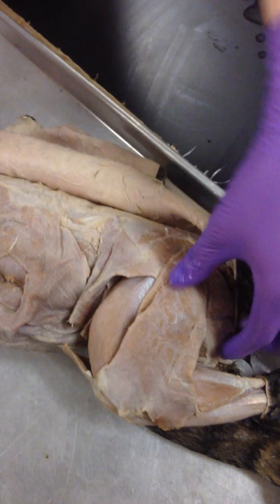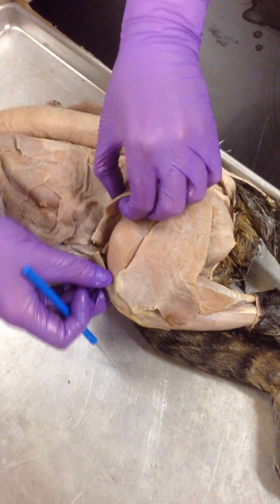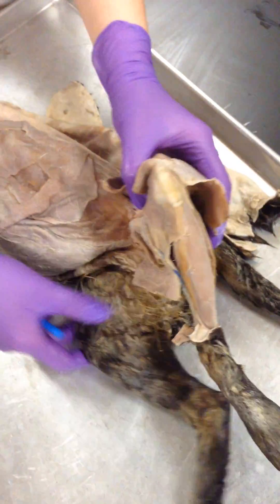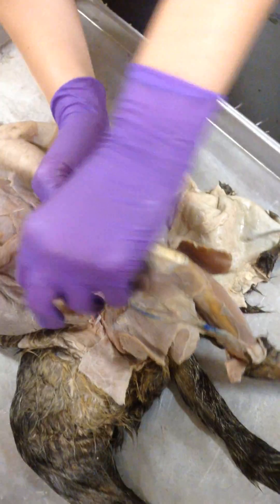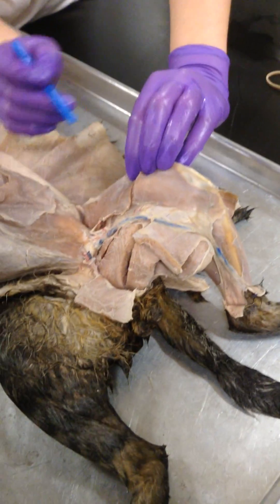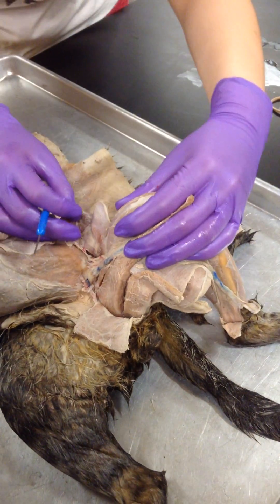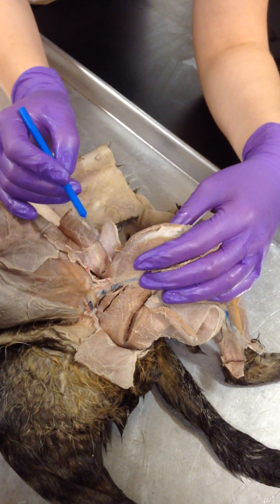This is the triceps. So we have our biceps femoris and our sartorius. And then we go on the inside of the leg. All right, you see the sartorius again. And the triceps are here. It's a big flap on this side — it's small on the other side, but on this side it's this huge flap, this huge thing right here. And underneath it, it kind of looks like a hot dog.